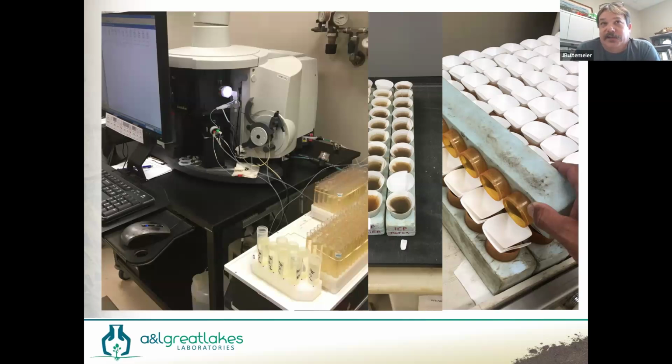So we'll actually use what's called ICP, inductively coupled plasma, and it will measure the nutrients in that acid without any additional chemistry. It's really a cool technology. And this is where the technologies we're seeing in the lab industry go. How do we get the answer with fewer steps and fewer materials?